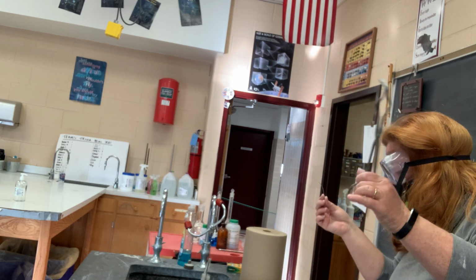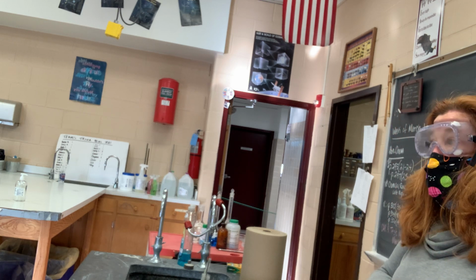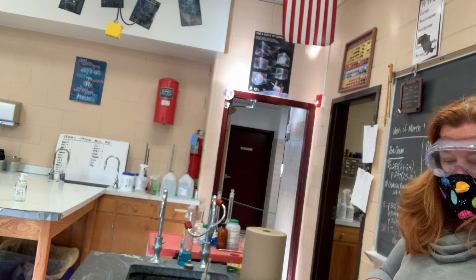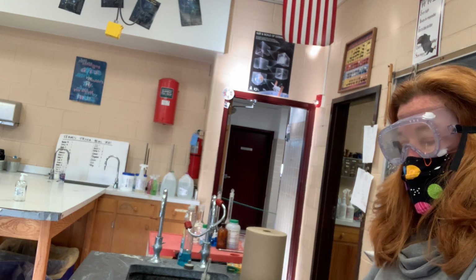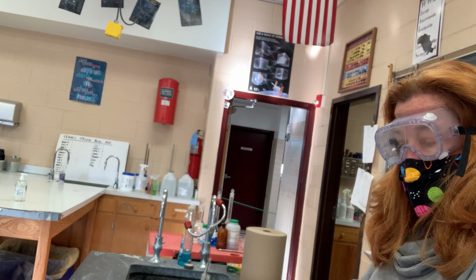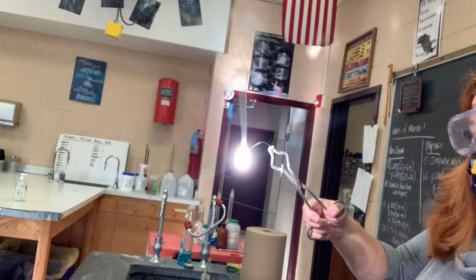Using the crucible tongs, hold the ribbon in the flame of a lighter. Note any change in appearance. Do not stare directly at the flame. I'm going to try to get it on the video without catching my hair on fire, which is always the main goal of a good day. See? There we go.